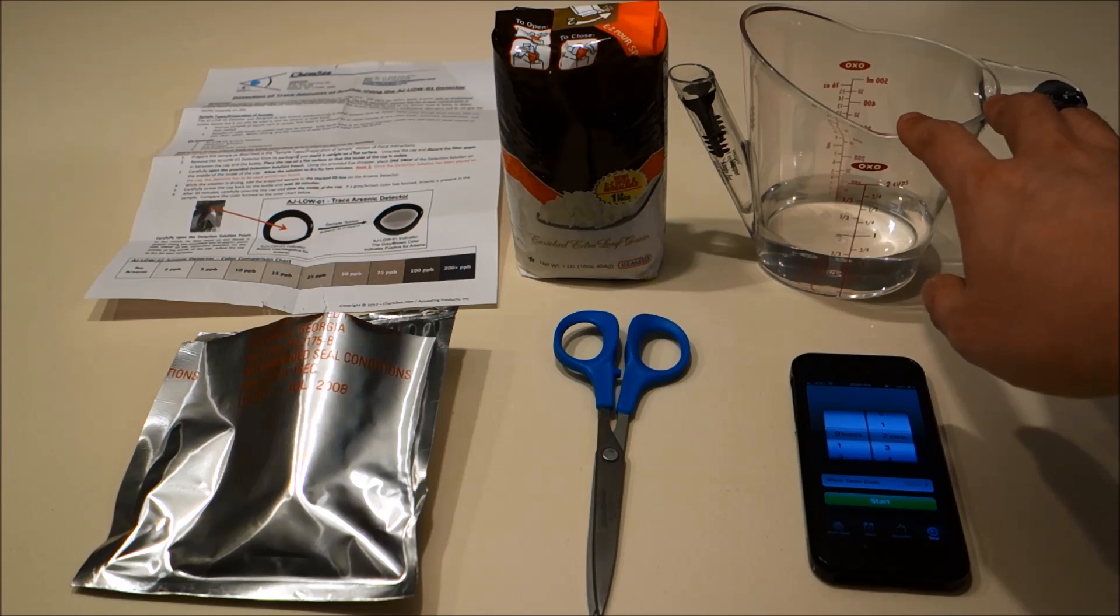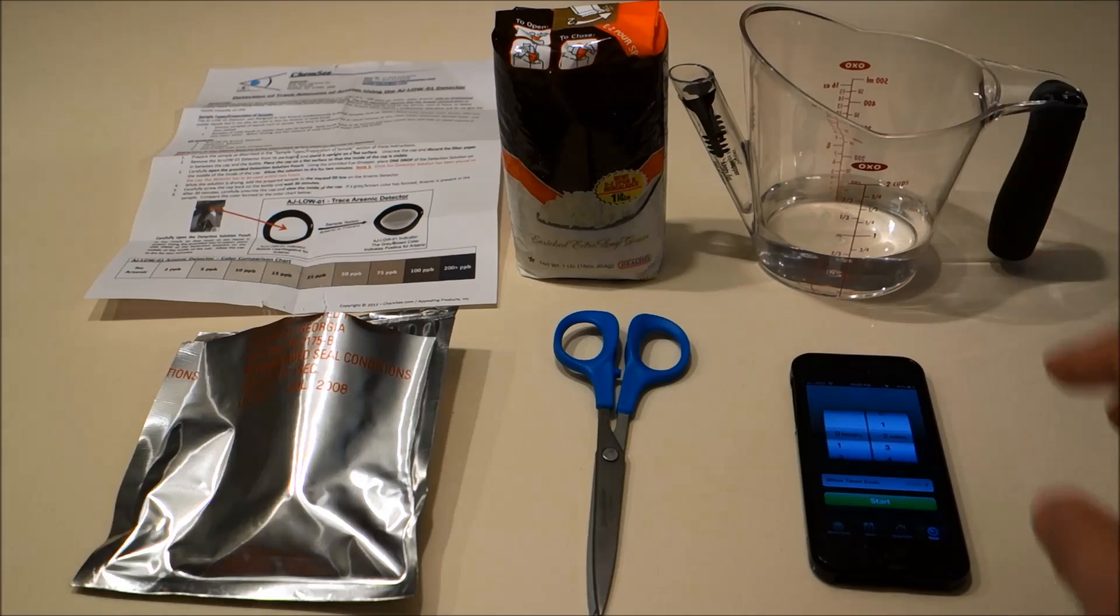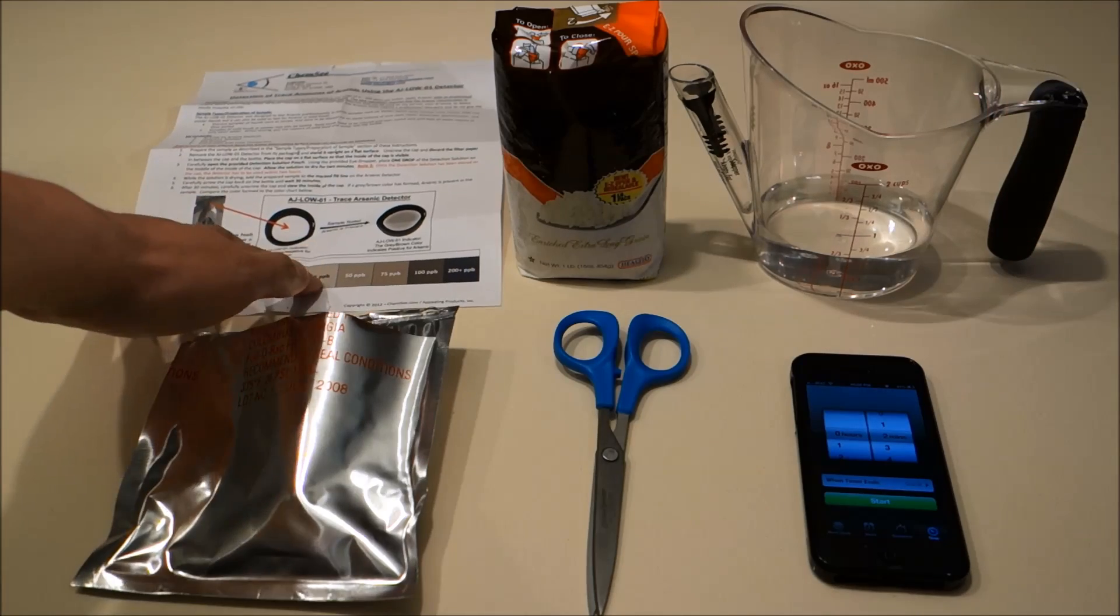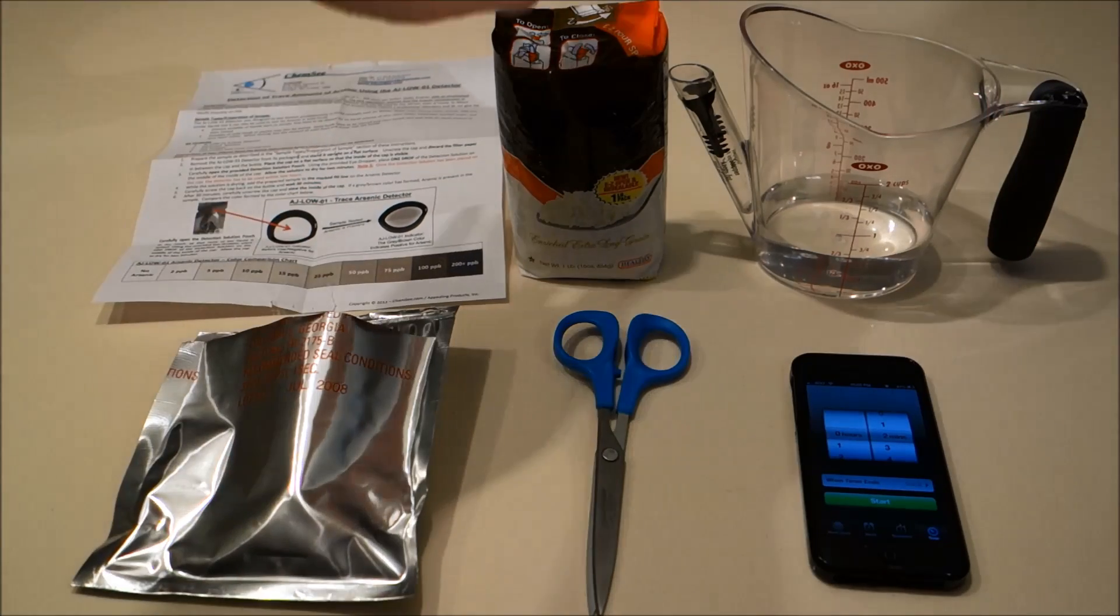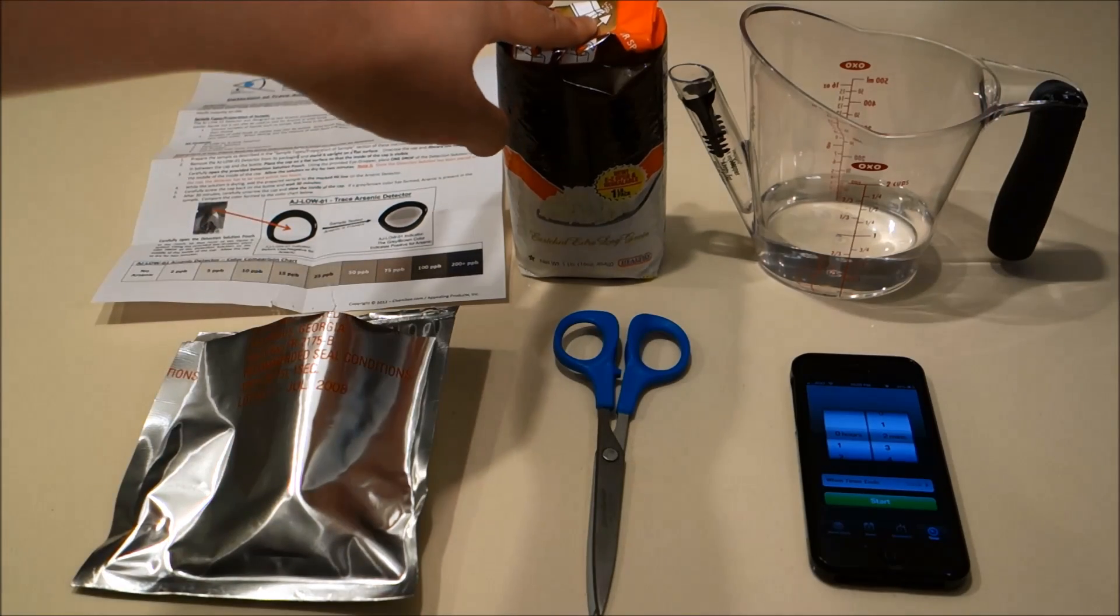About a quarter cup of filtered or distilled water, the instructions from the kit, and our rice sample.